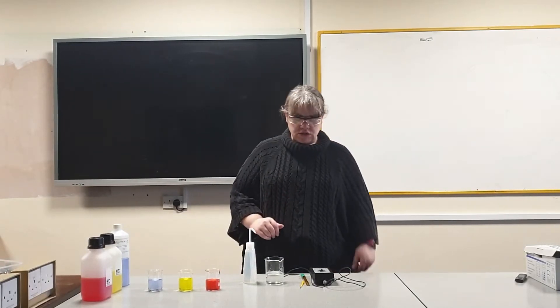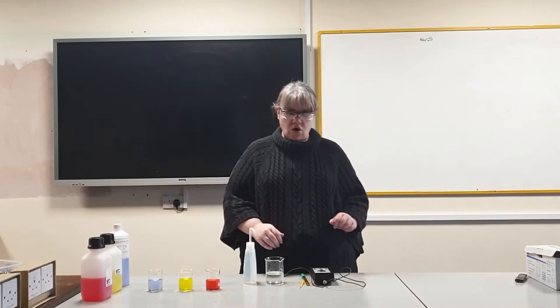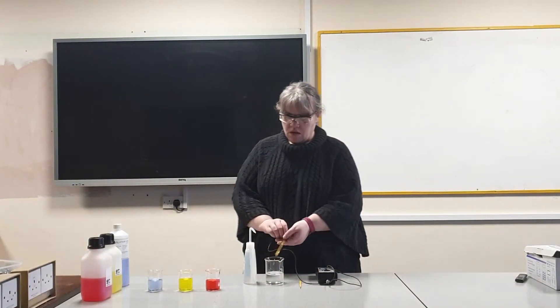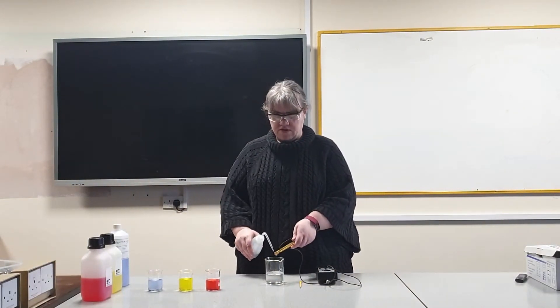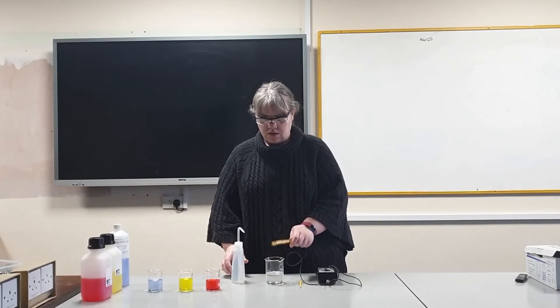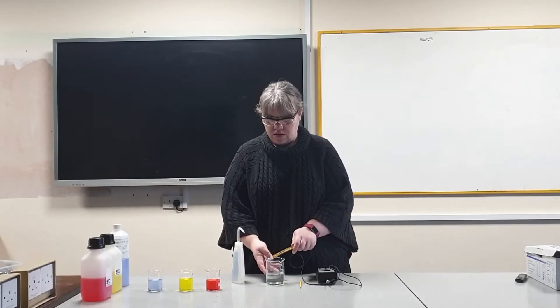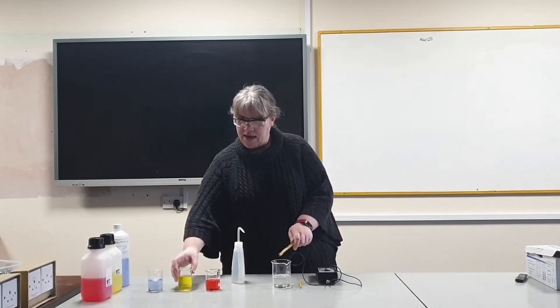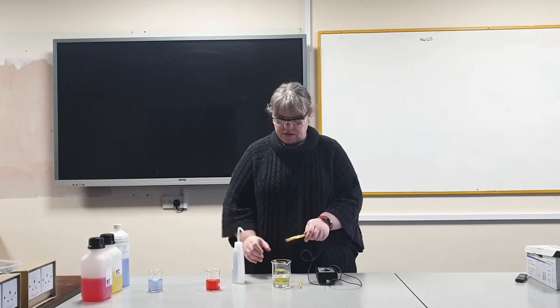First thing you need to do is switch your pH meter on and put the probe into some distilled water. Rinse the probe with distilled water and then place the probe into one of your buffers.